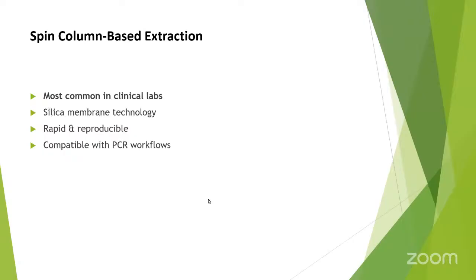In the case of spin column based extraction, this is the most common in our clinical laboratories, and it applies silica membrane technology. This is rapid and also reproducible, and is compatible with the polymerase chain reaction workflow.